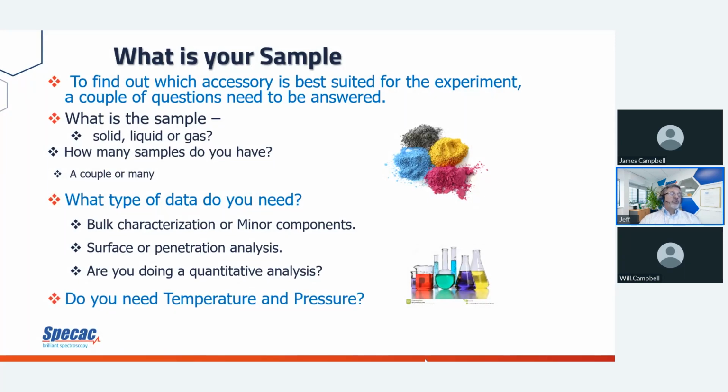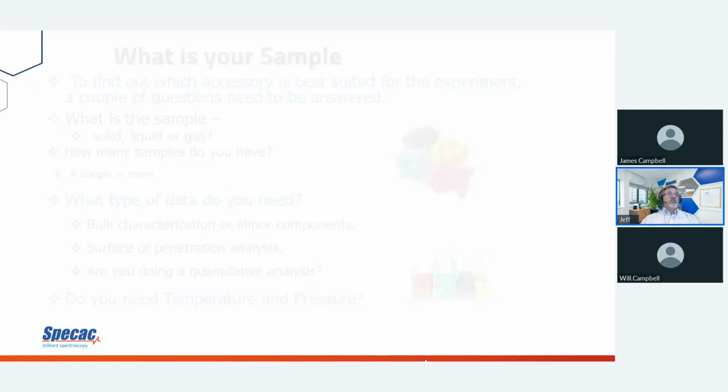But there's other things that you want to consider. Do you need to heat up your sample? Do you need to put it under pressure? Or do you need to put it under pressure and temperature? There are accessories for all of those.